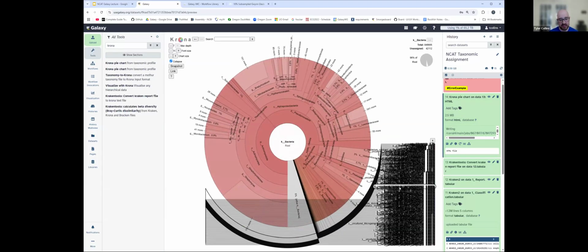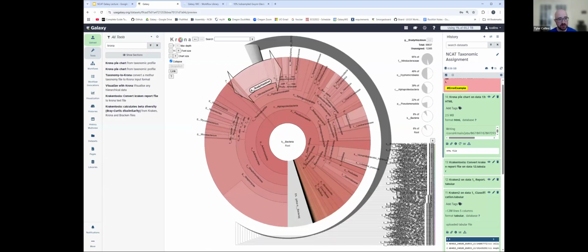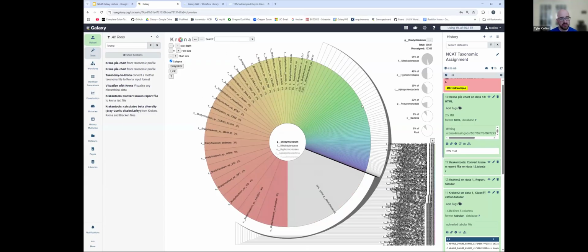It will give us a very dense view here, but it will start to move and remove everything else and just show what's in here. If we want to get a better look, we can click on something random, like this genus up here. It will load in and show here on the right. We're at 8% of the total root, 8% of the bacteria, 22% of the phylum, 39% of this clade, 49% of this order, 95% of this family. And we can come here and start to see individual species that might be present.